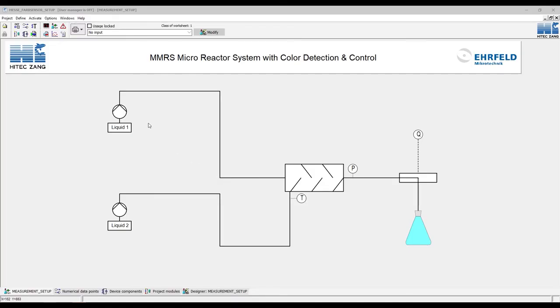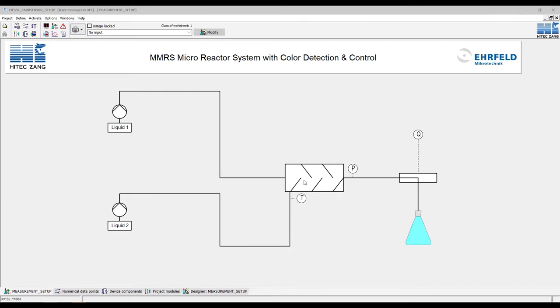We are now in the LabVision software where we can create our user interface for our microreactor. What you can see here is a flow chart of our setup, where we have two dosing pumps on the left which pump our liquids with the food coloring through our microreactor in the middle. We want to measure the temperature, the pressure, as well as sense the color value at the output. We can use this flow chart to simplify and aid us in creating a user interface.